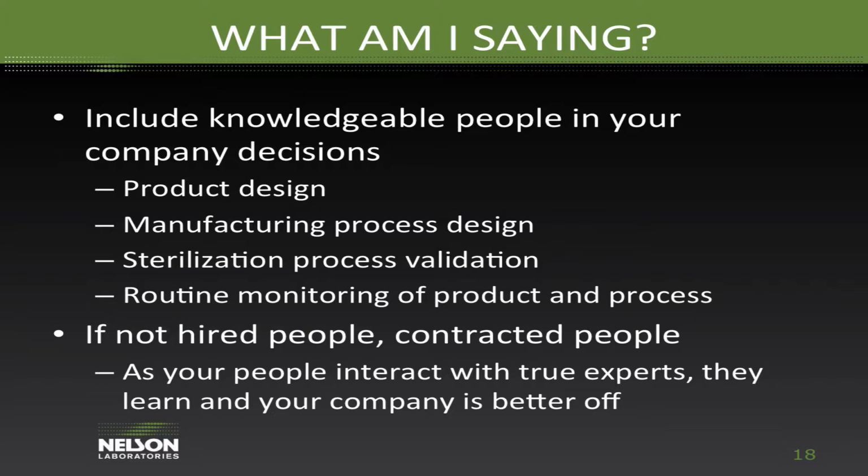The benefit to involving these people in these processes is that whoever you've assigned microbiology and sterilization to, as they're working with these people, they are beginning to build up that internal expertise. So the long-term benefit is much better.